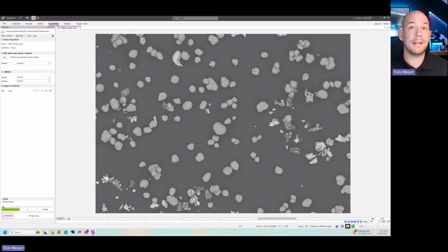So by default, we are in interactive mode, and you can see I only have 2 steps and then a results step. So protocols give you a guided workflow. It's very easy to change certain parameters and follow the steps to come up with your own unique protocol with your settings. So the first thing that I'll do is, if I need to, I can change this class name, but it's set to particles, so that's perfectly fine. If you're working with color images, this dropdown would show red, green, blue color, but because we're working with EM images, we only have a monochrome.